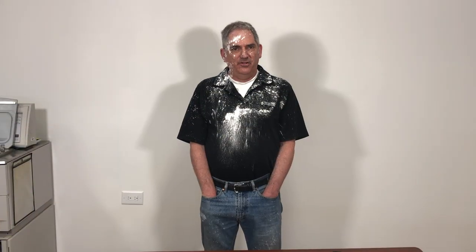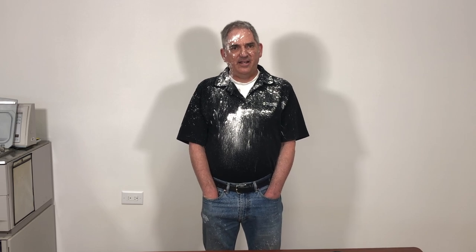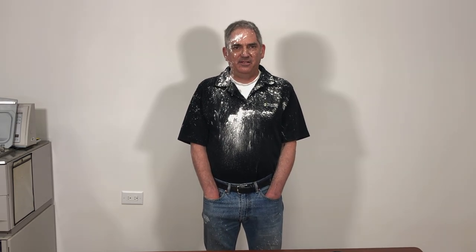Wow, those coils were really dirty weren't they? Hope you enjoyed that and if you have any questions feel free to ask them below or give us a call. Thanks!